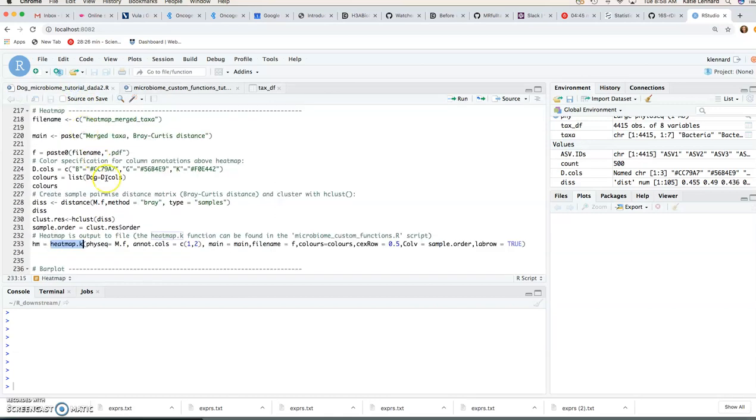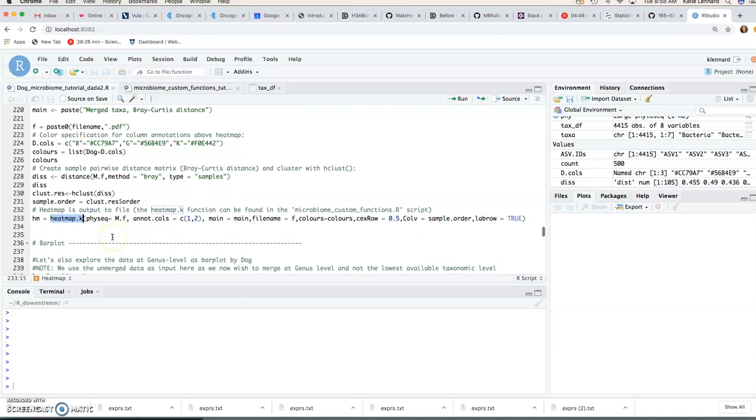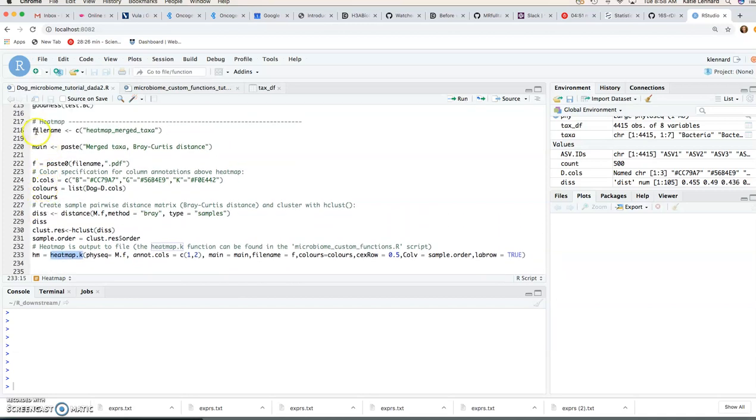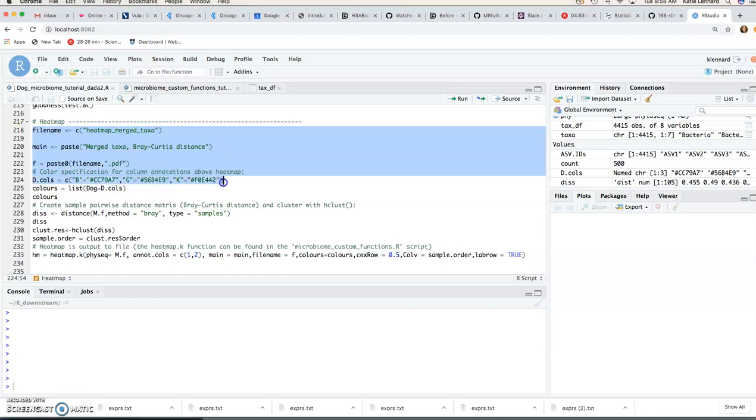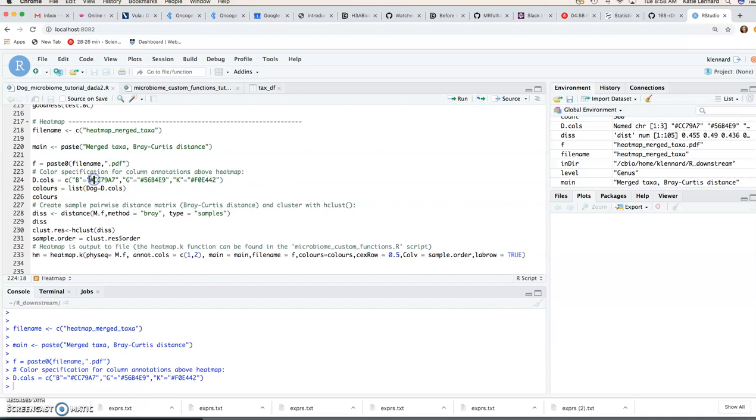So let's see if we can have a good example here. So if we've specified file name, our title, the colors so you can see the colors you specify so you have dog B, G and K so these hash codes here are all our colors so you can choose your own colors and it's specified as a named list.